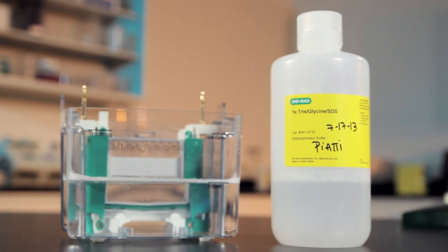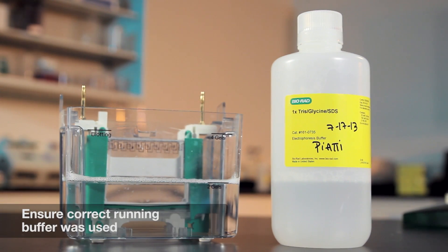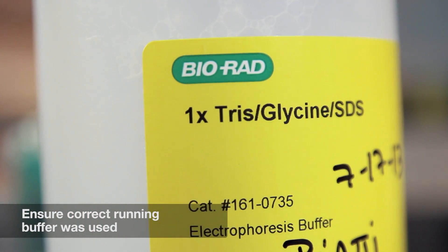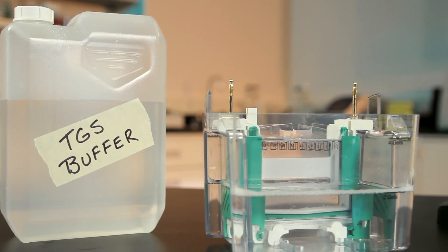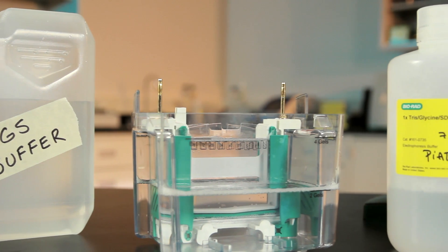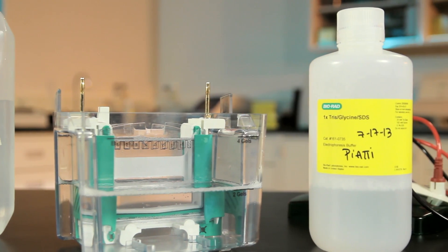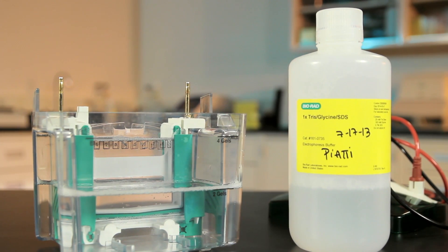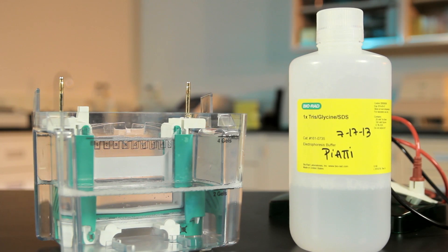Very often an E1 error is caused by using a running buffer that is too dilute. Make sure that you are using the correct running buffer for the gel used. If the running buffer is self-made, check the composition and how it is made. If the running buffer is pre-made, either by BioRad or another company, make sure it is diluted correctly.